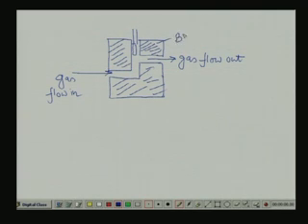It will work as a heat sink, please note, work as a heat sink, because there is some sort of heating here. And I want to make the detector independent of the other parameters, because the detector output should depend solely on the different components of the eluting peak. It should not be influenced by any other components of the detector itself. So, that is the reason we are using two detectors. So, let us look at how the two detectors are used.